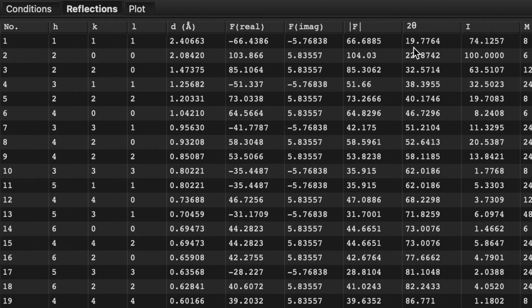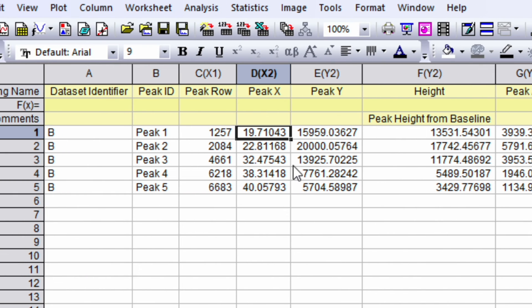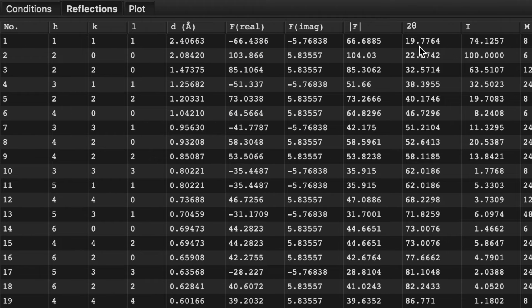Now our job is to tune these numbers such that these numbers will match with the peak center calculated from the XRD diffractogram. How to do that? We can tune the lattice constant.